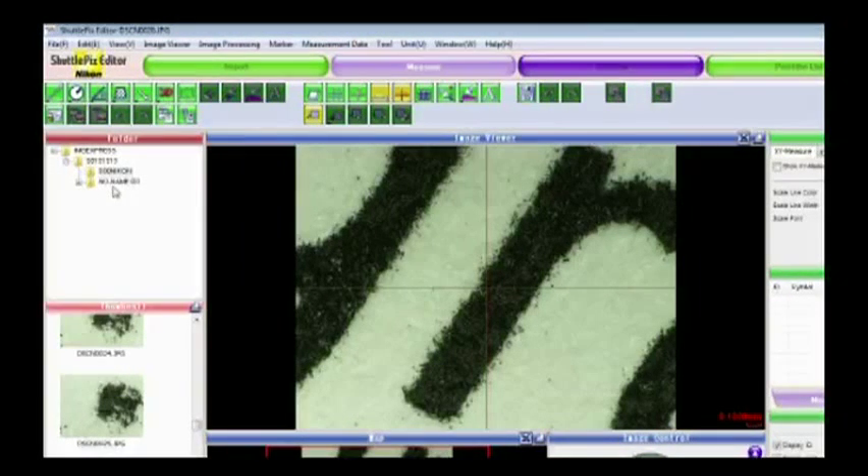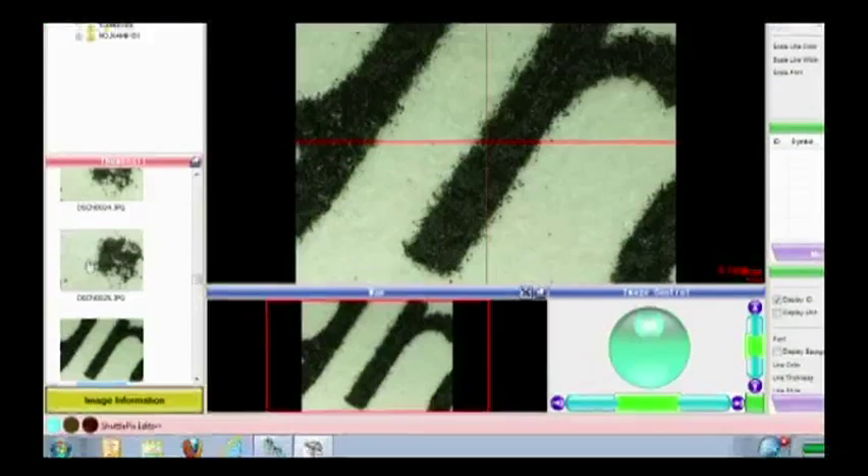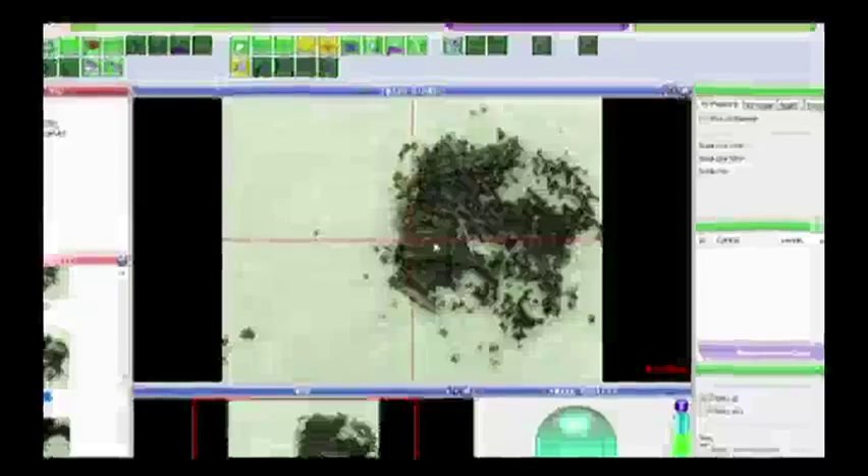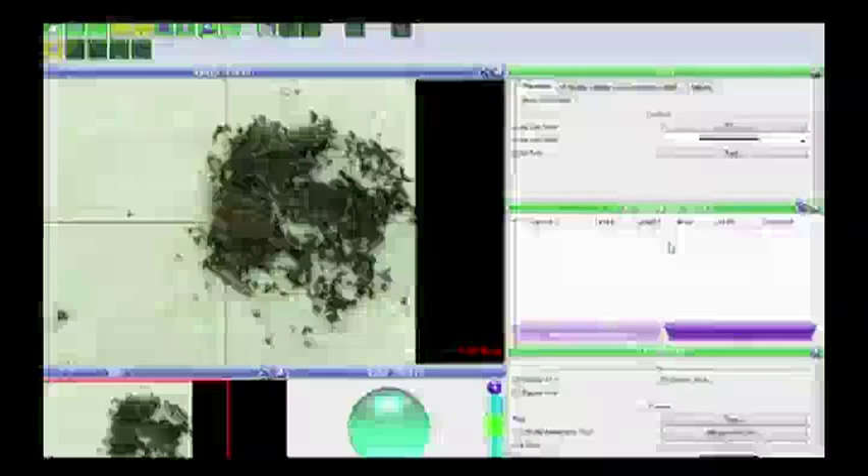I select a thumbnail and the image appears in the center pane, with navigation tools below it to move around the image. On the right-hand side is information about the image, and any measurement data would appear in the middle section of the right panel. I can also export images or measurement data in Excel format for later analysis.